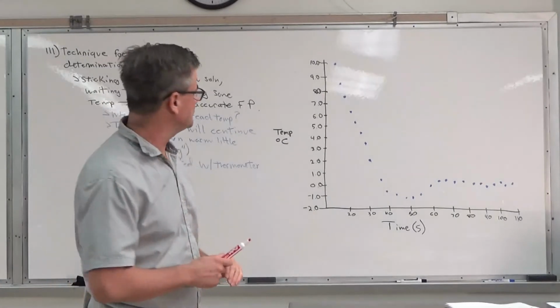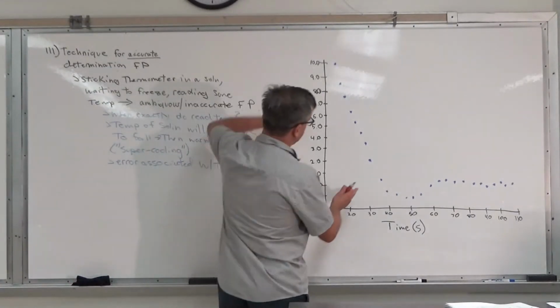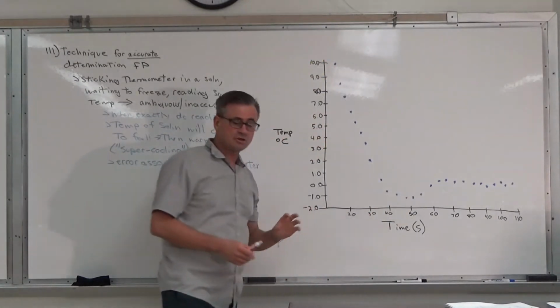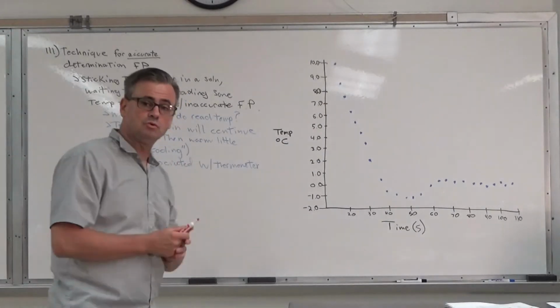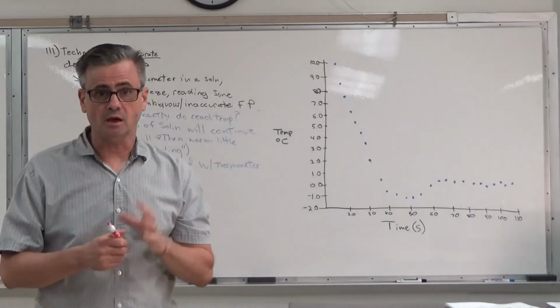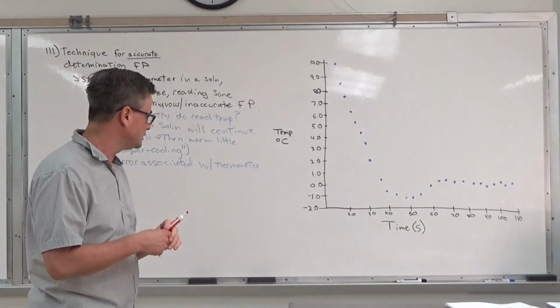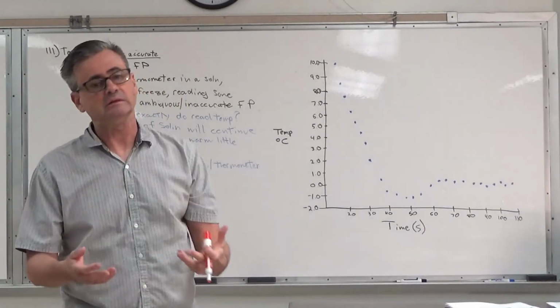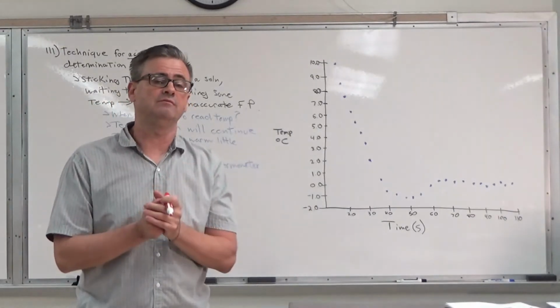You are then going to have to pick the two linear areas. You have to pick some area in here that's linear, and you're going to have to tell Excel which data points to include. Now, for Excel specifically, I have included some notes on how to do this in my worksheet. If you're using something other than Excel, you may have to do a little bit of investigating.